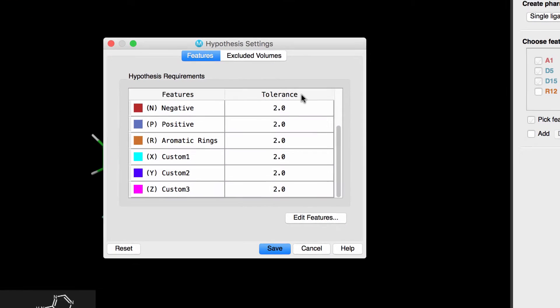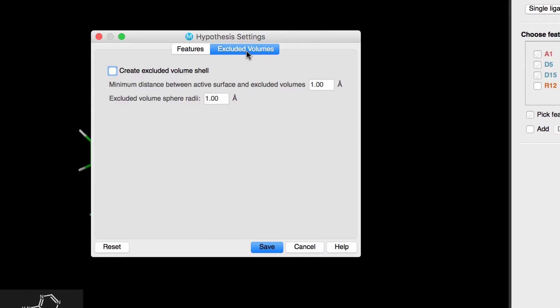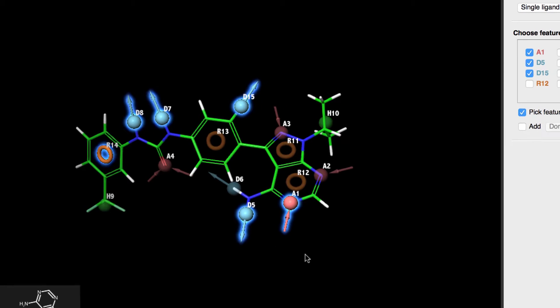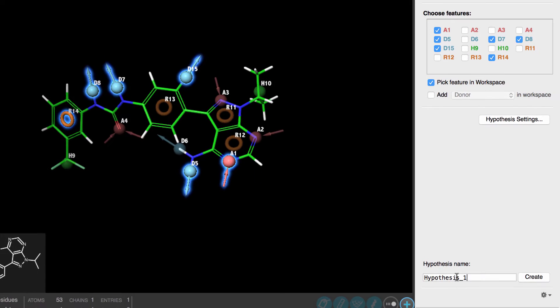And over here, we can create an excluded volume shell around the ligand, as a means to have a pseudo-receptor. So, let's create one, using the default sizing. We'll click Save, rename the hypothesis, and click Create.